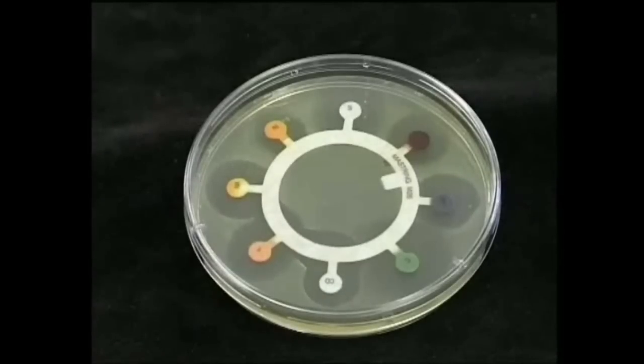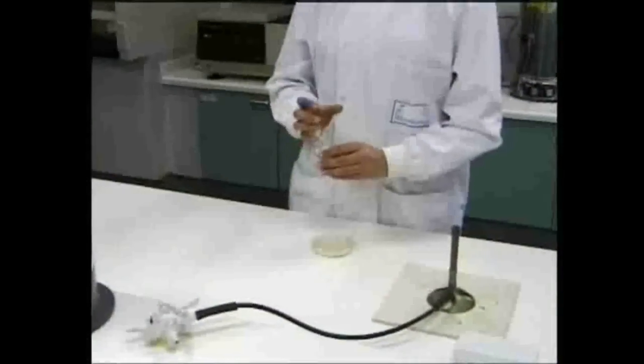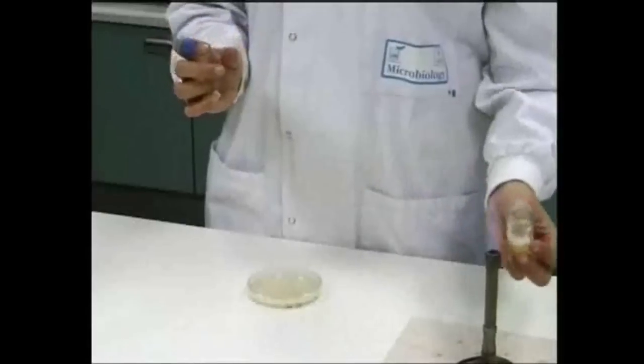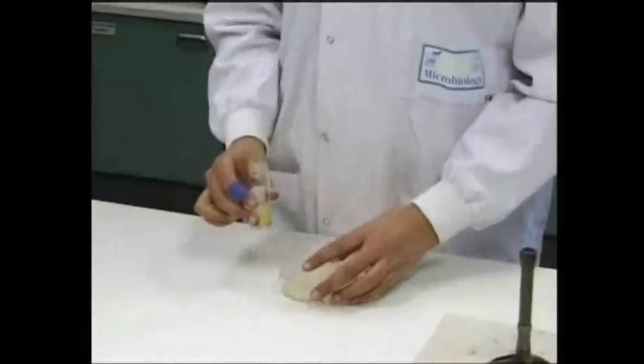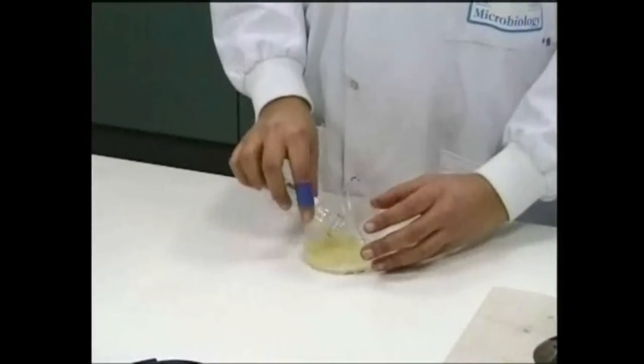Lawns can be prepared in one of two ways. Firstly, the lawn can be created by flooding a sterile agar plate with the desired microorganism. To flood the agar plate aseptically, the culture bottle is opened and the neck is flamed. The lid of the Petri dish is then raised and enough bacterial culture to cover the surface of the agar is tipped onto the plate. This is usually about one cubic centimeter.